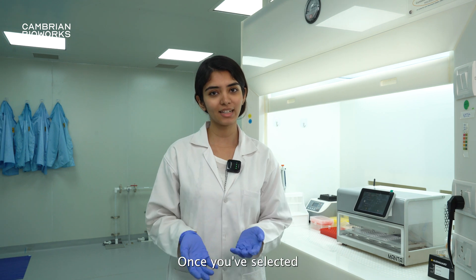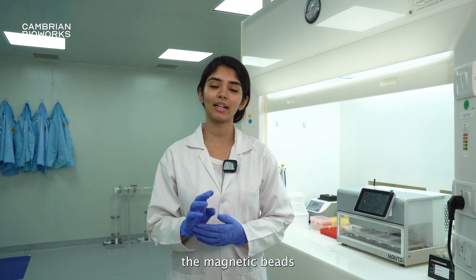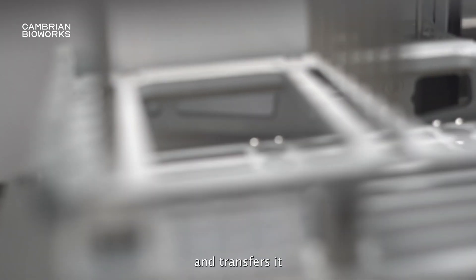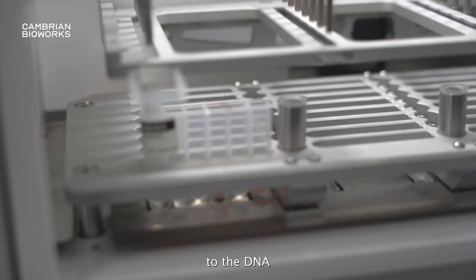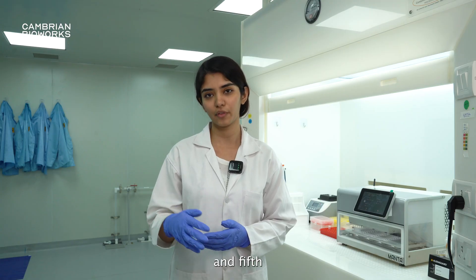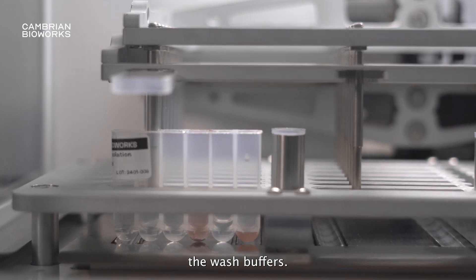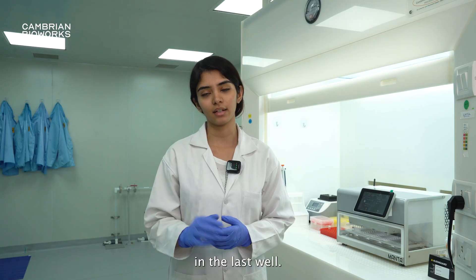Along with DNA and RNA, Manta can also extract cell-free DNA from plasma. Once you've selected your extraction protocol, Manta picks up the magnetic beads from the second well and transfers them to the first well with your lysate. The beads then bind to the DNA from the lysate and transfer it to the third, fourth, and fifth wells containing the wash buffers. Finally, the magnetic beads elute in the elution buffer that is in the last well.